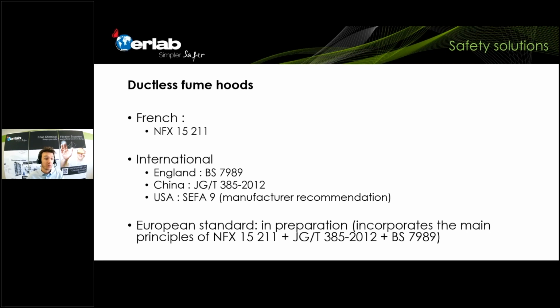Maybe interesting for you to know as well, there will be a European standard for ductless fume hoods. Hopefully it will be published soon, which will be a combination of the Chinese standard for ductless fume hoods and the French one.